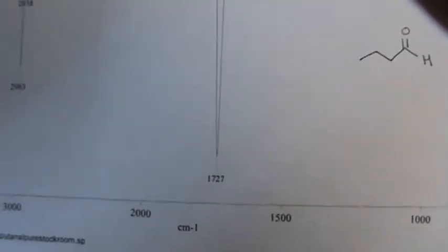And it is going to turn out almost exactly like the one that was in Pavia. So there is obviously your CO stretch, right? 1727. And then right there, 2877, 2938, and 2963. That's your alkane carbon H stretch, sp3 carbon.